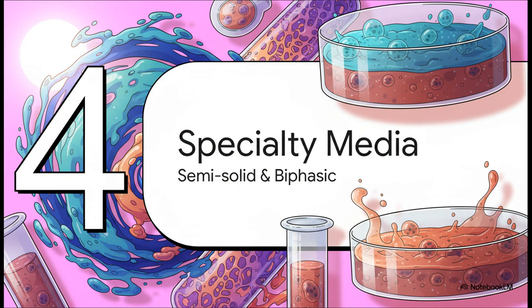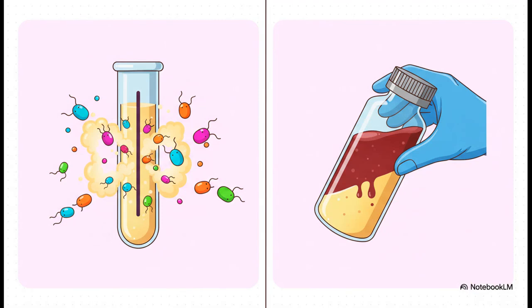Okay, so we've got our basic liquid and solid media down. But now we get to the really specialized tools. Beyond the basics, there are two specialty consistencies that are used for very specific tasks: semi-solid and biphasic media. Let's put them side by side.